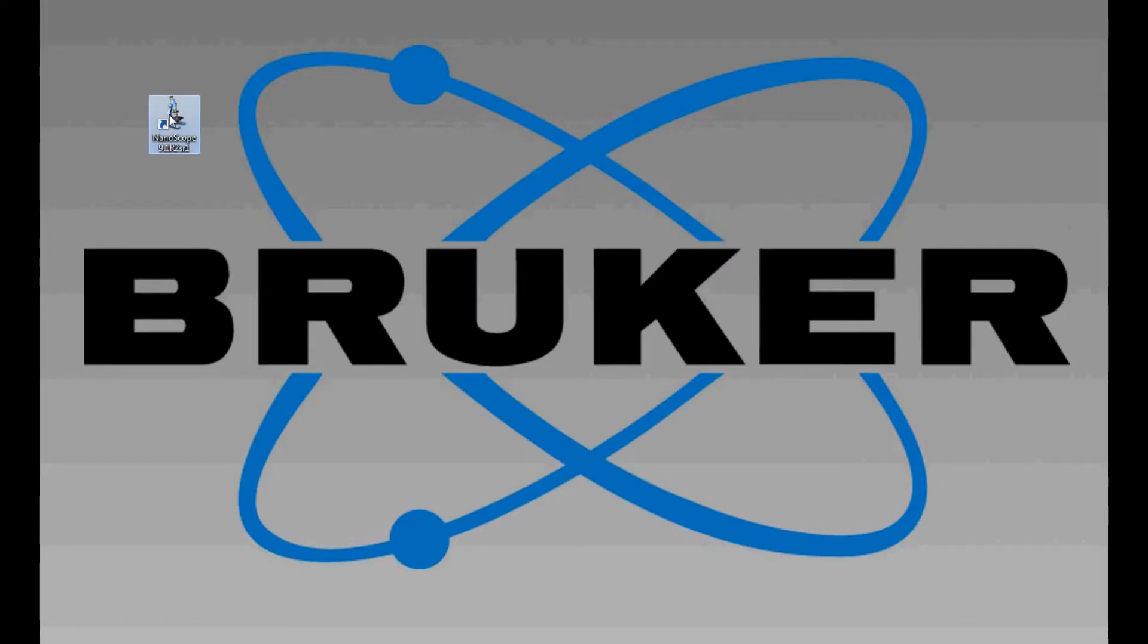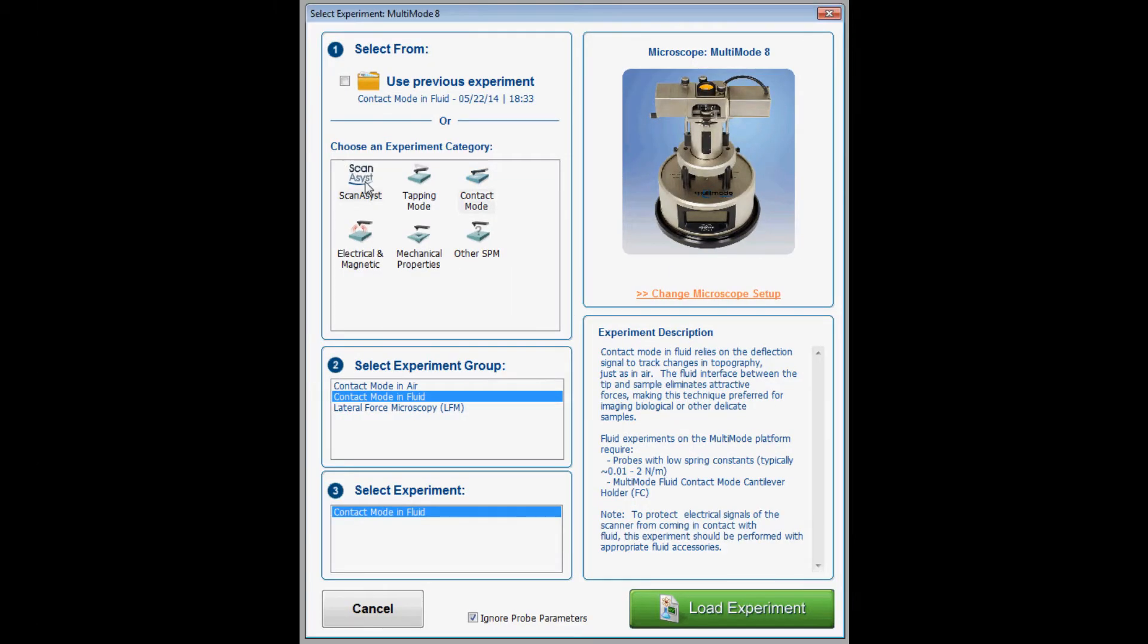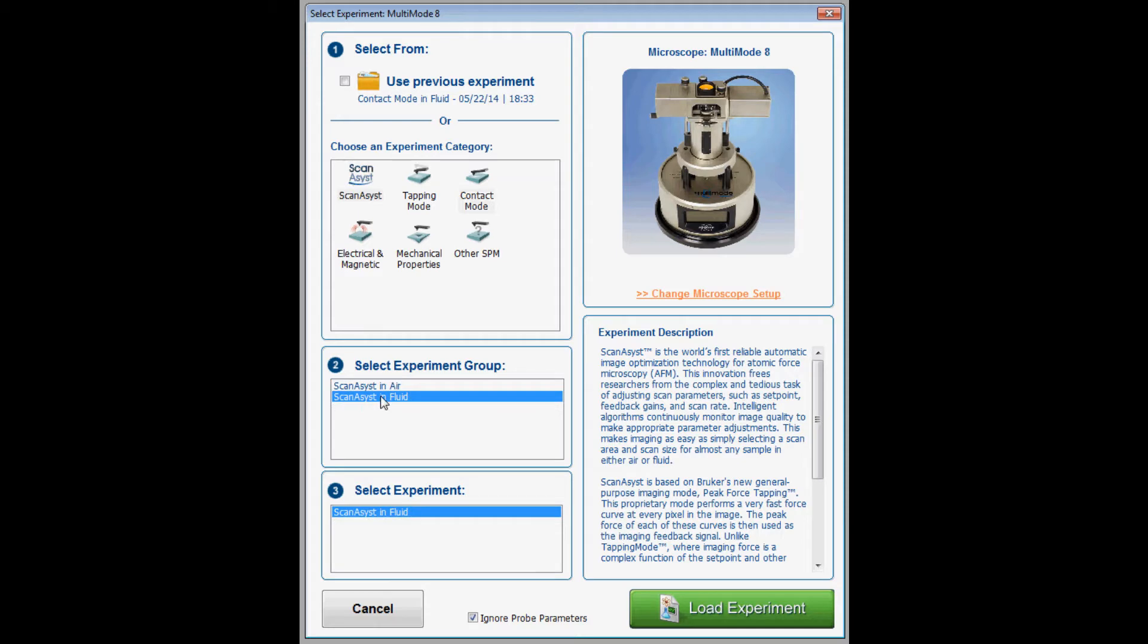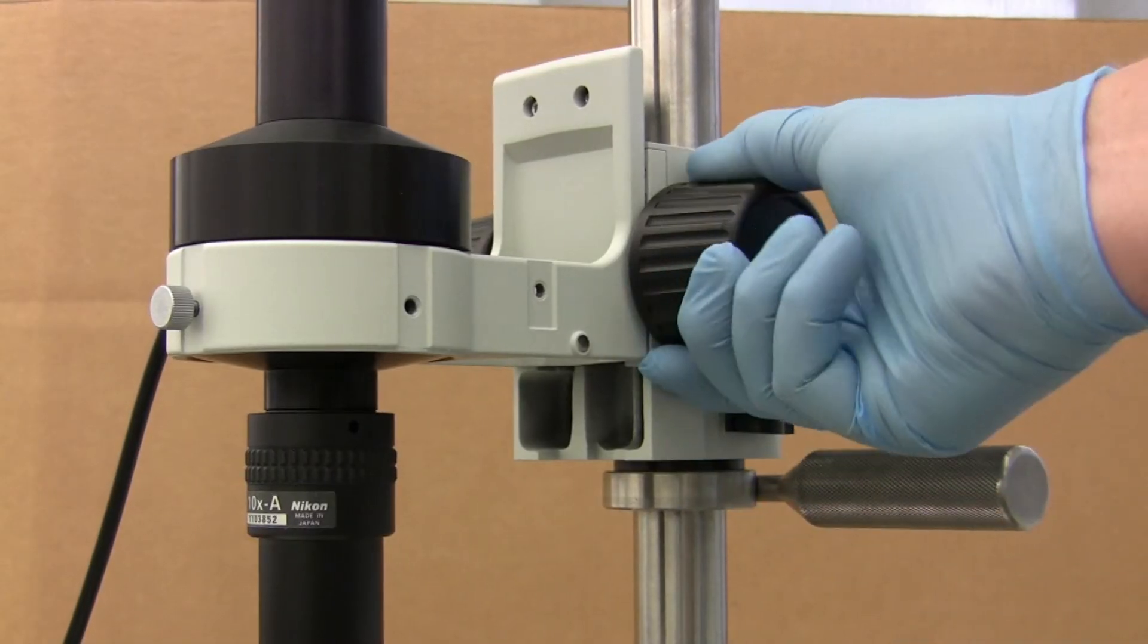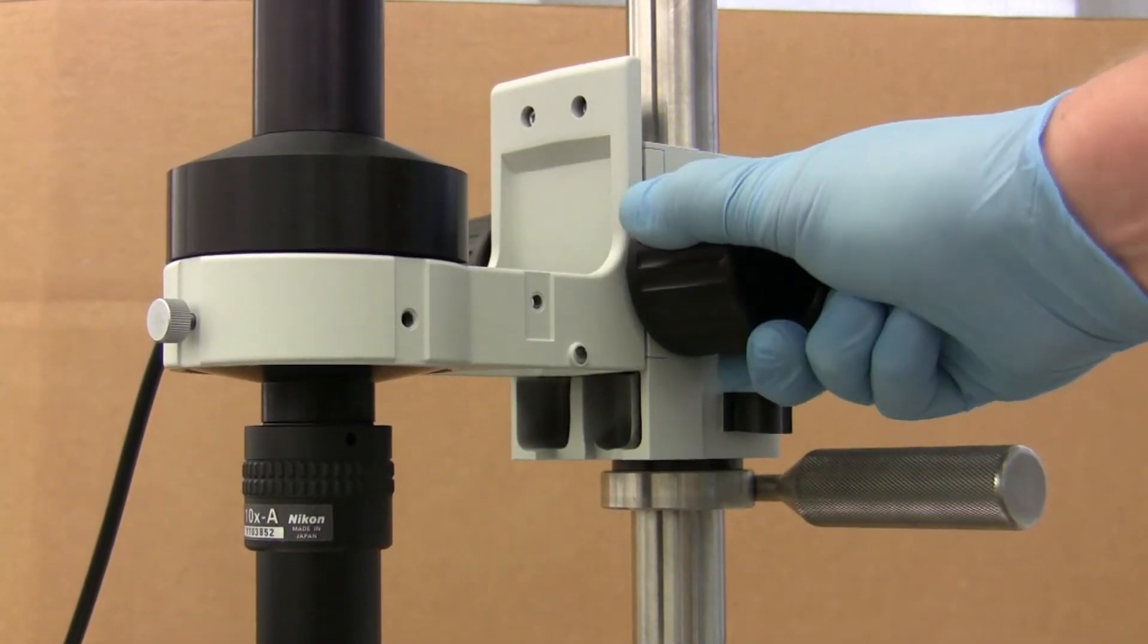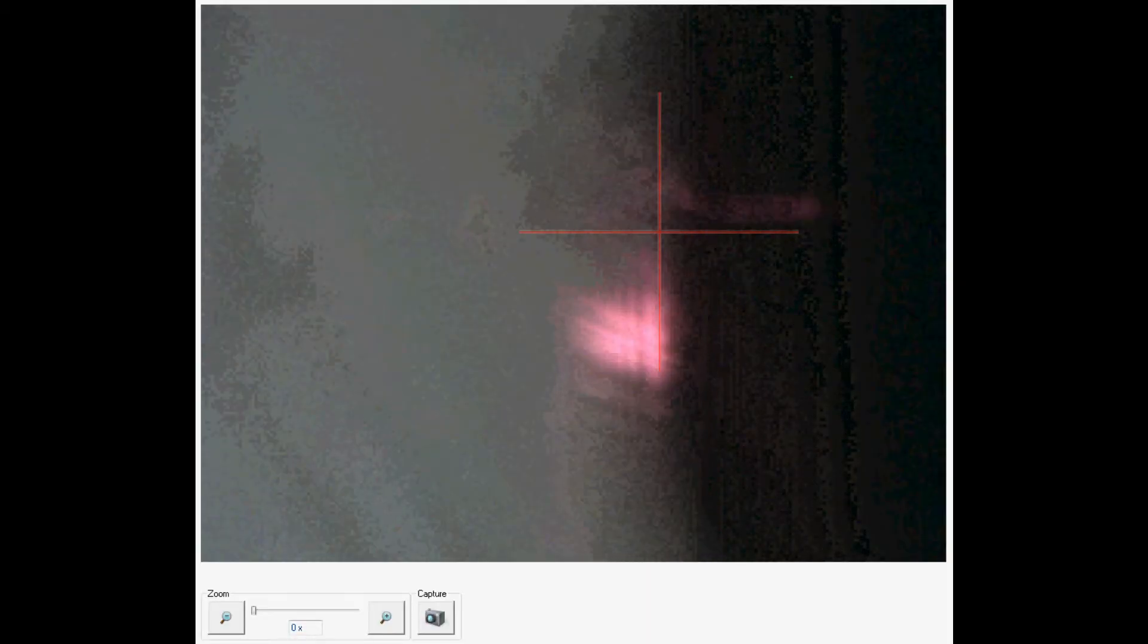Start the nanoscope software. Select scan assist mode from the experiment category and scan assist in fluid from the experiment group. The optical microscope camera can be used to view the probe. Use the optical microscope's position knobs to focus the camera onto the probe and the sample surface to make sure they are within normal approach distance.